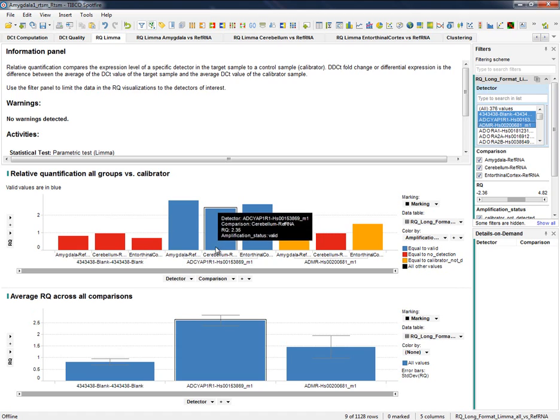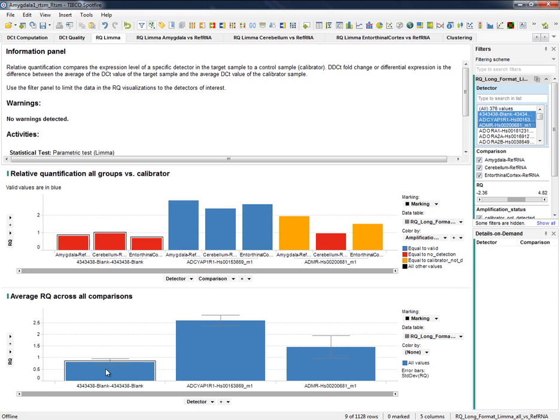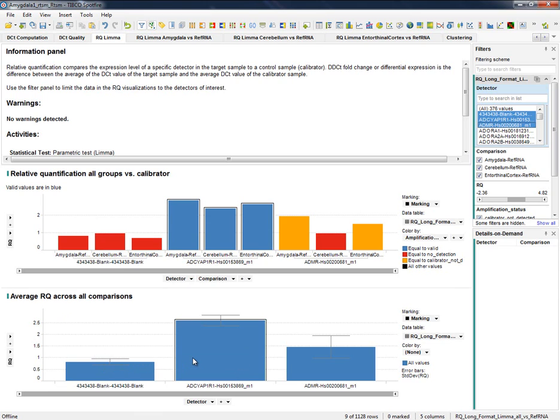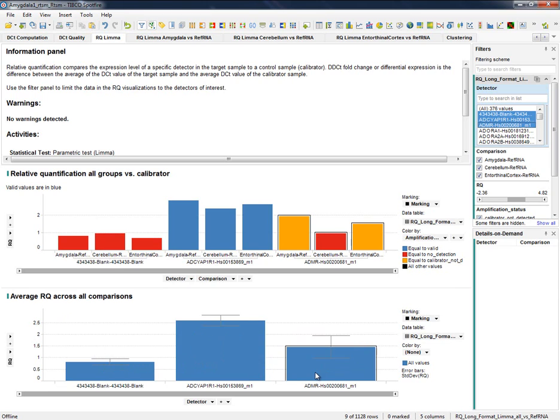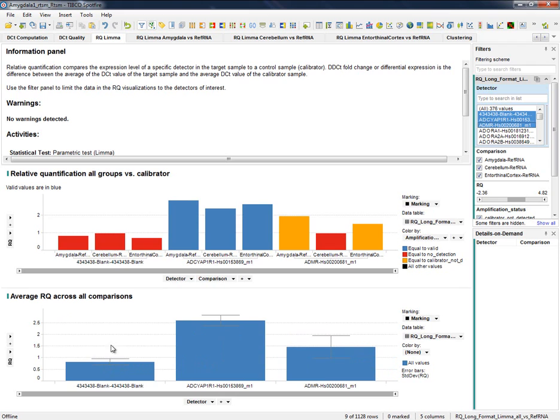Average RQ reports summarize former information with the RQ average of each detector in every tissue and its deviation. Low deviation means that detectors behave in a very similar way along the conditions.